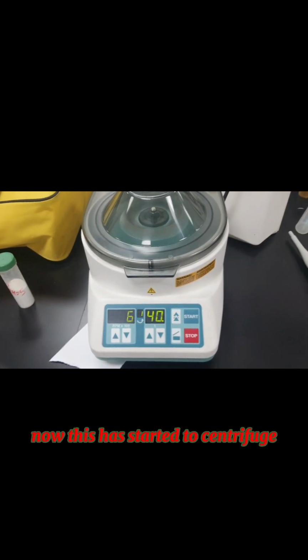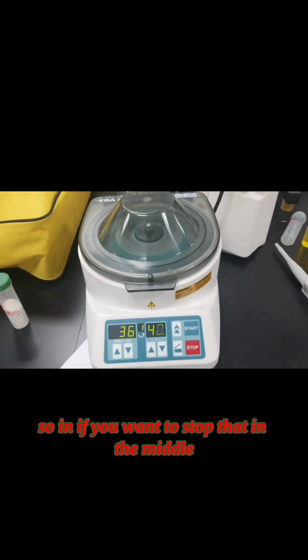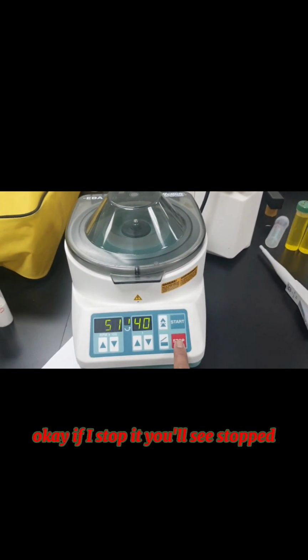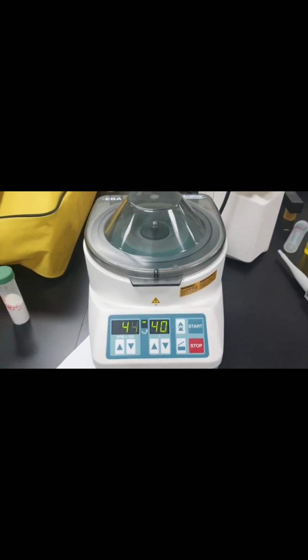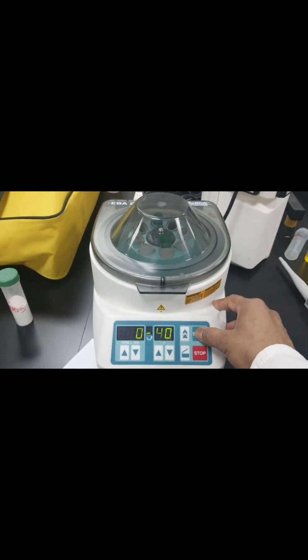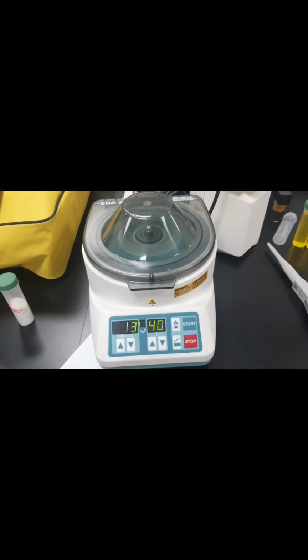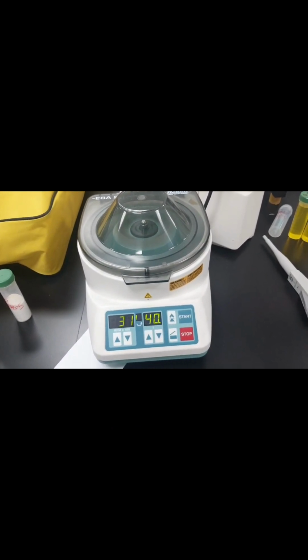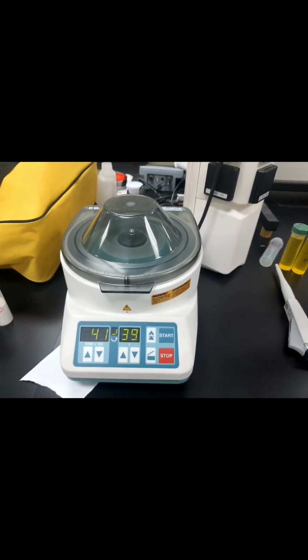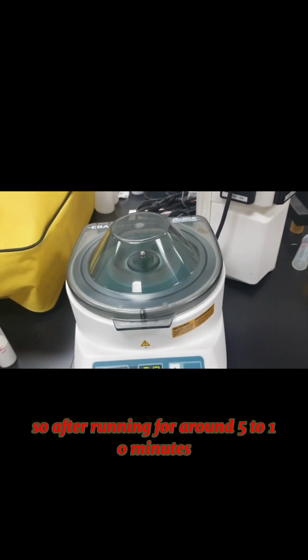This has started to centrifuge, you can see here. If you want to stop it in the middle, you can just press the stop button. If I stop it, you'll see it stopped. If you want to start again, I'll just start it again. Now this has stopped.